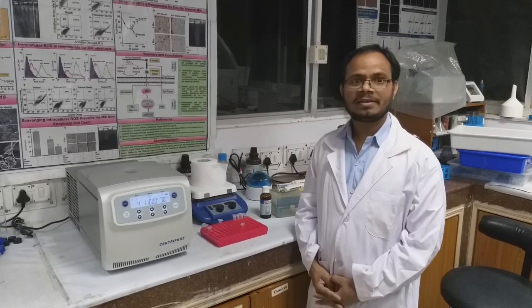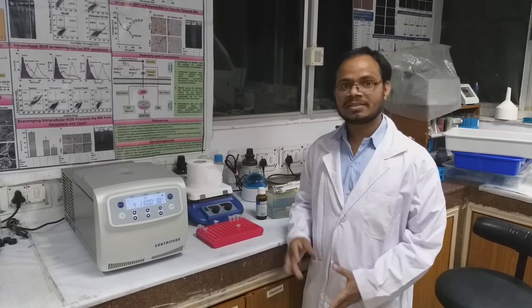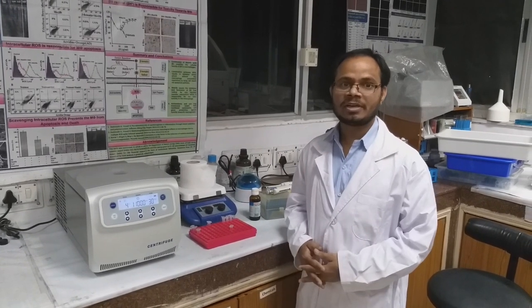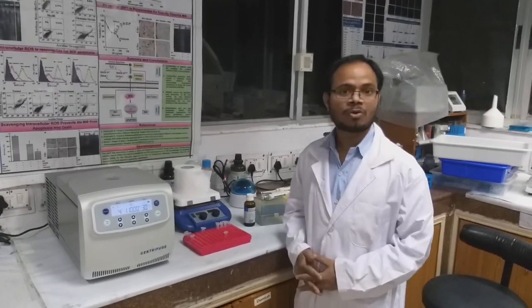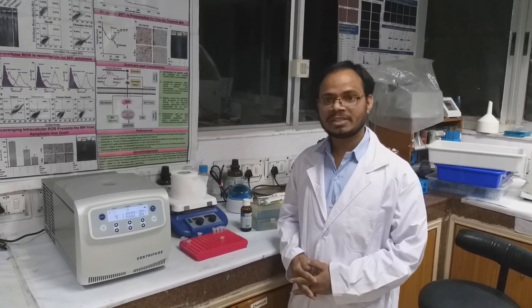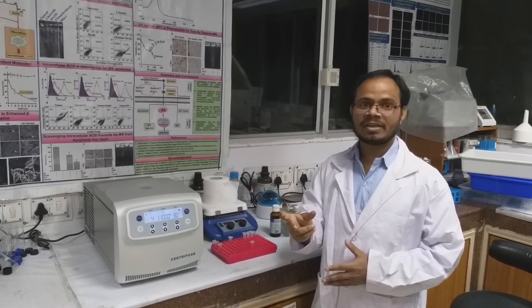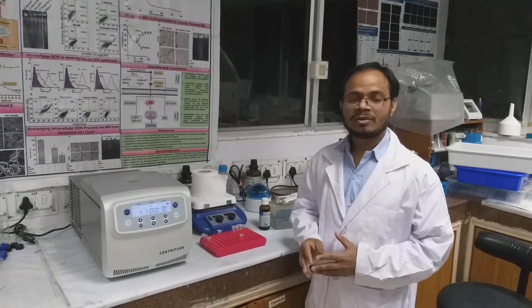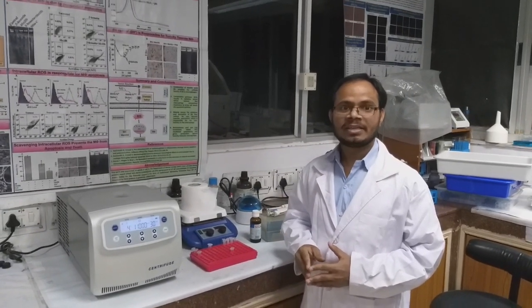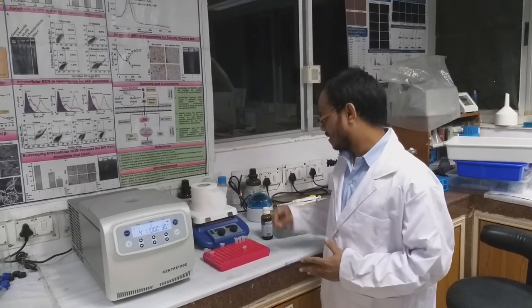We have already seen isopropanol precipitation of plasmid DNA, but there is another method which we can utilize for isolation of plasmid DNA. This is called phenol chloroform extraction. In this method, once we recover the supernatant which contains plasmid DNA, we have to mix it with an equal portion of phenol chloroform mixture, which is readily available.